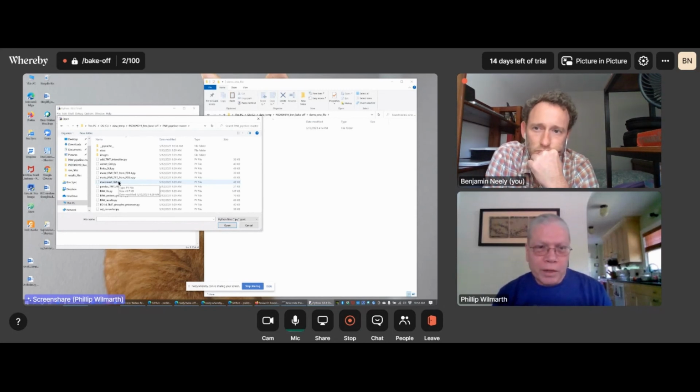That's the first step. Then we've got a little GUI program that sets up and runs Comet. And then we have a GUI program that looks at the score histograms and sets up the FDR analysis. And those things all have GUI in their name. And then we make our final reports with the PAW results program. And those are kind of the basic ones that we're going to run today. So, MS Convert GUI.